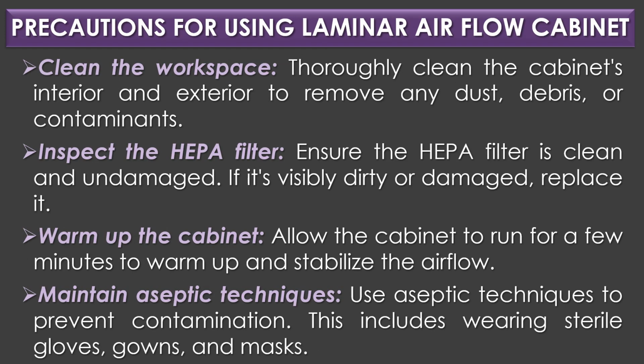Precautions for using laminar airflow cabinet. Clean the workspace. Thoroughly clean the cabinet's interior and exterior to remove any dust, debris, or contaminants. Inspect the HEPA filter. Ensure the HEPA filter is clean and undamaged. If it is visibly dirty or damaged, replace it.